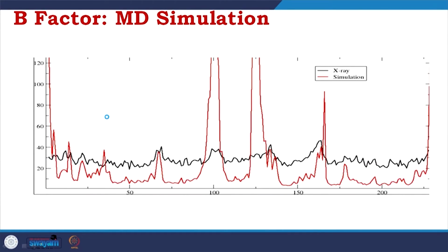More interestingly, simulation. As I talked about, in the simulation we have a force field, and we develop force field parameters depending on what type of factors are influencing the biological macromolecule. For example, for protein we take bonded parameters, which are bond stretching, bond bending and torsion. For non-bonded it is Coulombic interaction, van der Waals interaction and hydrogen bonds.